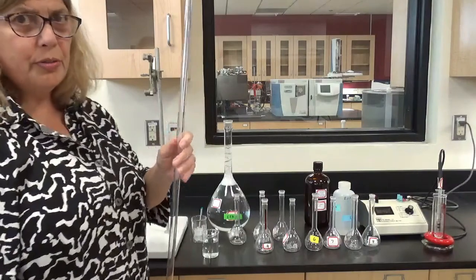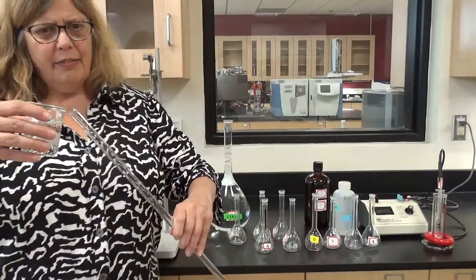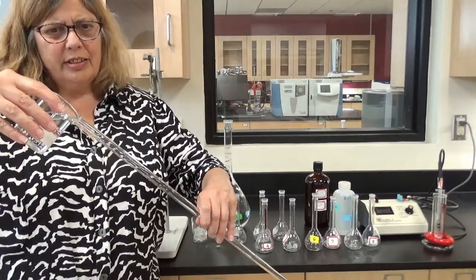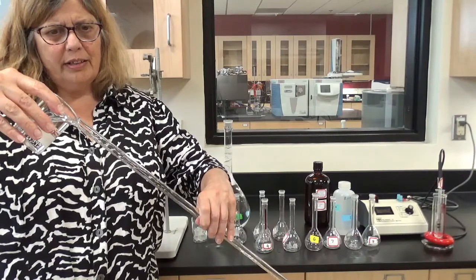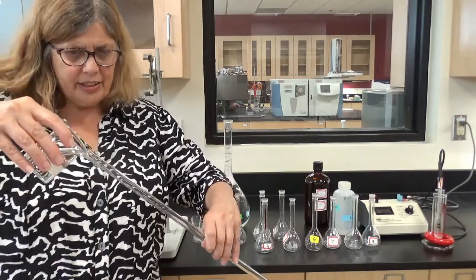But I want to show you that when I fill this burette with the CTAB solution, I'm going to be very careful to pour it down the side of the burette, because that will stop the foaming. Because don't forget, this is a surfactant.